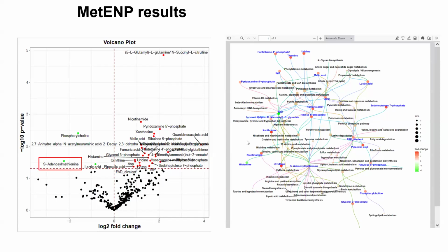So this set of results provides a good starting point to even continue further exploration towards interpretation and mechanistic understanding of what is happening in this disease. And these are some of the metabolites, and as we saw those 4 genes, one can further follow up on them with respect to network-based analysis.